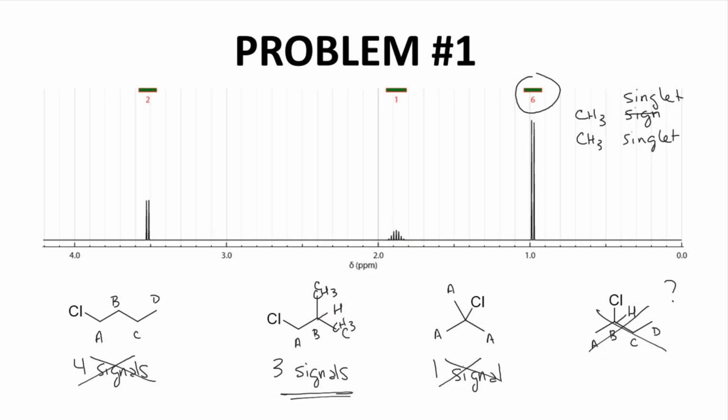That's a good match. Now notice these 2 hydrogens. That's a CH2. There's 2 hydrogens. The spectrum says it's a doublet. It does have 1 neighbor, so those should be a doublet. And furthermore, they're further downfield because this chlorine is next door. And chlorines and oxygens, typically based on their electronegativity, are doing an inductive effect. That causes de-shielding of the carbon and those CHs, and that moves these down to typically between 3 and 4. That's the typical range. So everything looks good. This is almost certainly our second compound. That's our answer, which on the question handout would be B.